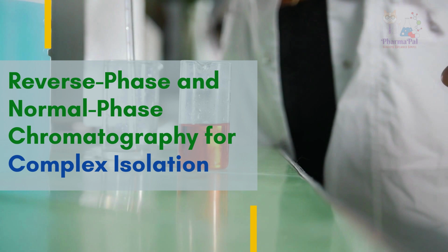Functional groups: the presence of specific functional groups, e.g., hydroxyl, carbonyl, can influence the reactivity and interactions of the compounds with reagents and stationary phases. This knowledge can aid in designing a more effective separation scheme. By considering these chemical properties and employing appropriate separation techniques, you can effectively isolate and purify caffeine, acetaminophen, and aspirin from a tablet formulation.